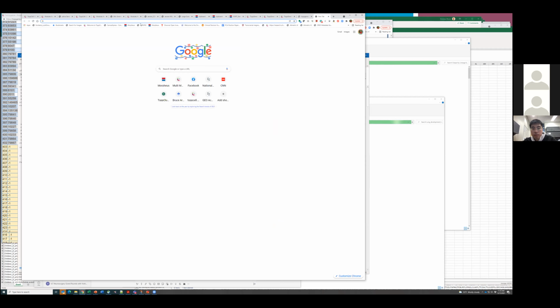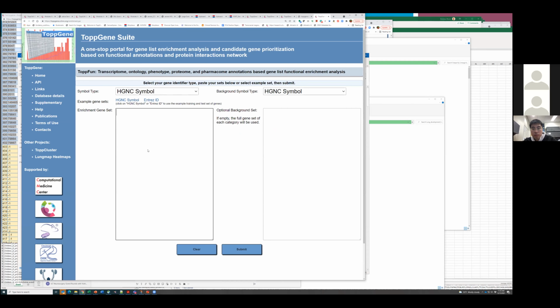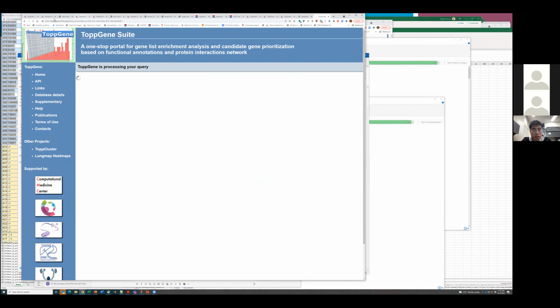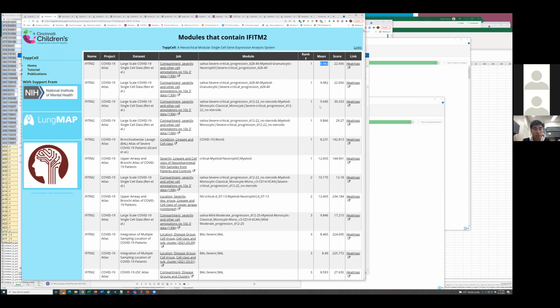And that's kind of what we preview in the view of the data set. Let me just explain what that means. And then these are looking for the enriched features of it. And so now going back here, instead of going to the heat map view, you could have chosen to go to the view of the data set, and then you could start to browse into it and see what's going on.